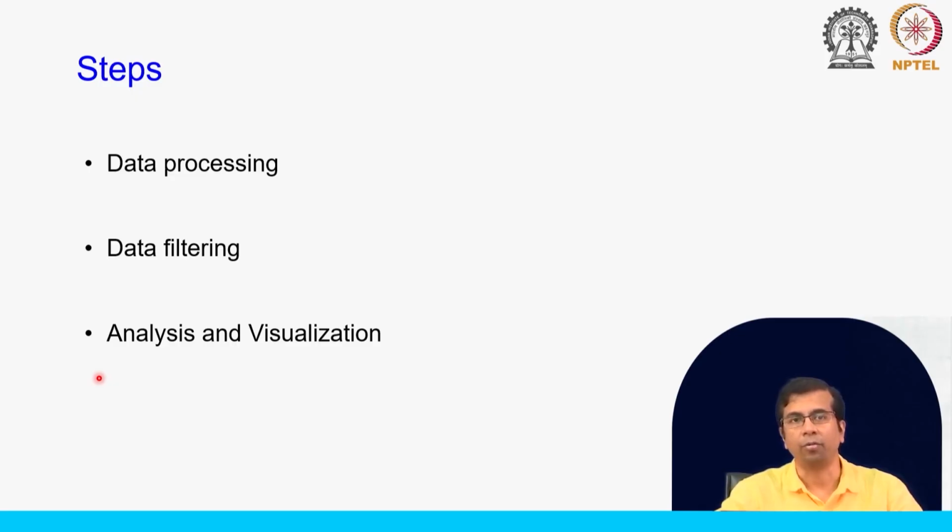We can write our own code and do a lot of customized filtering of that data to get to the actual observations, the real observations. As you know, flow cytometry data is very noisy and there is a lot of background noise. Then you might have cellular aggregates, debris, all those things. So, we need to get rid of all this noise, debris, etc. and focus on single cell data, right.